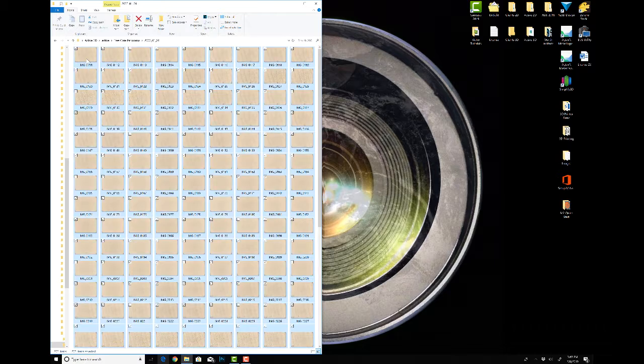One of the things you could do is just confirm how many photos are in it. So Control A. Remember what I said: we set the interval to 100, and that means the servo moves 100 times. That doesn't mean that it takes 100 photographs. For example, if you set that to 2 steps, what's going to happen is picture, step, picture, step, picture. So you end up with 3 total pictures when you program 2. Because we set it at 100, we're going to have 101 total photos per folder, or per frame that we're going to use for the panoramic.